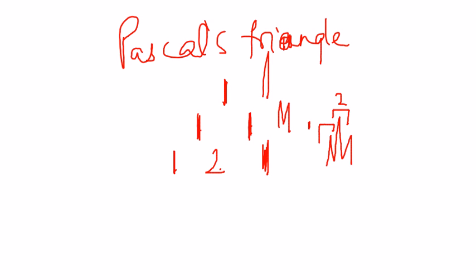If it's a quartet, you would say first peak as is, 1 plus 2 is 3, 2 plus 1 is 3, and this is 1. So the first peak is small, the second peak is 3 times that size, the third peak is 3 times that size, and the fourth peak is 1. So the intensity of the first and the last one is going to be exactly the same, and the two middle ones are going to be 3 times the ones on the side.